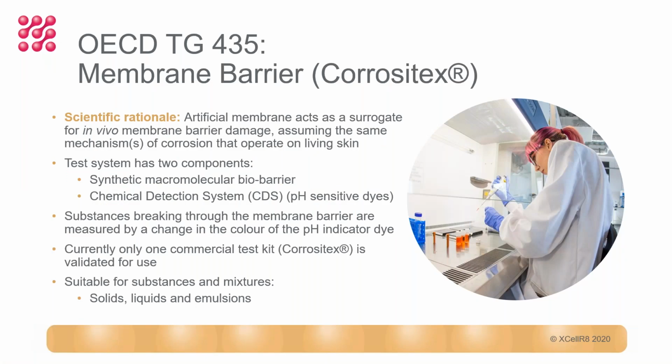So the scientific rationale behind the Corrositex method is that rather than having a biological system as we have with the reconstructed skin, here we have an artificial membrane barrier which acts as a surrogate for the in vivo skin and allows you to look at damage to that barrier. An assumption is being made that those same mechanisms of corrosion that operate on living skin would take place on an artificial barrier. And so the chemical is actually corroding the artificial barrier.